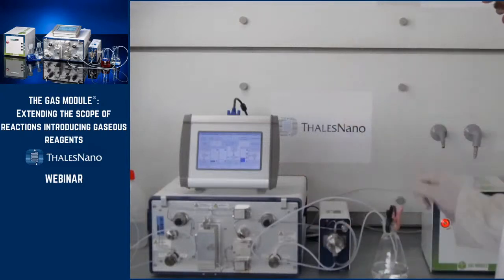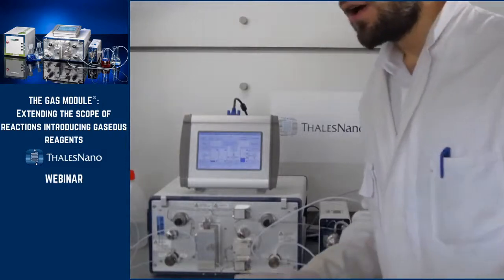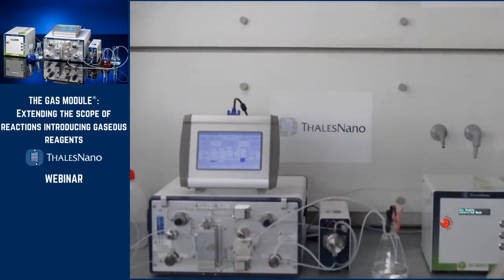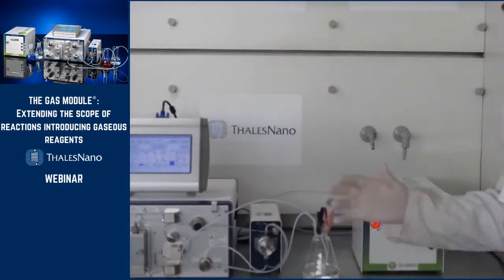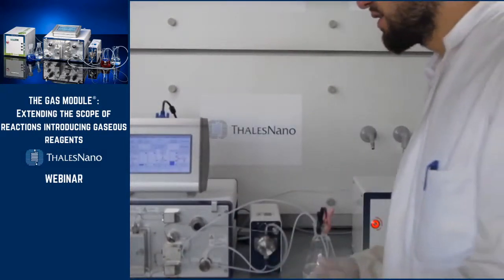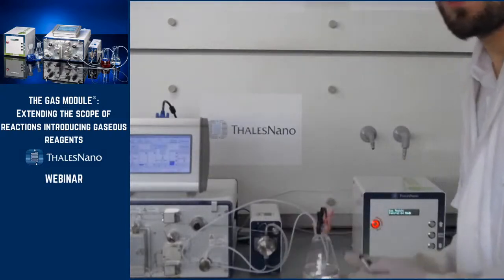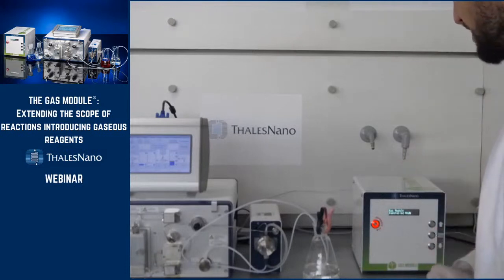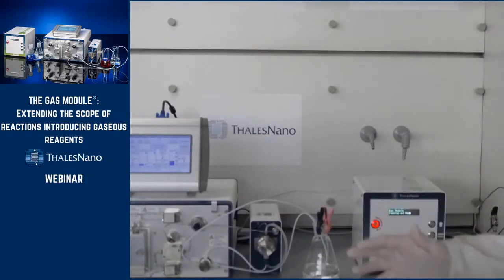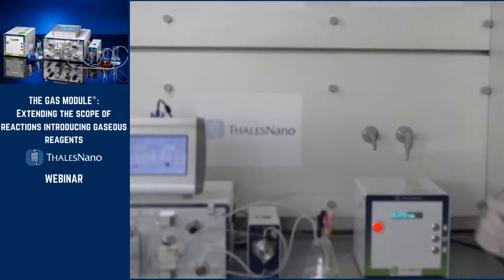So here was the description of the H-Cube. But now, let's say that instead of hydrogen produced inside, you'd like to play with other gases like carbon dioxide, carbon monoxide, methane, ethane, and there are up to 13 gases pre-programmed. You can do it quite easily by connecting the gas module, which is here.